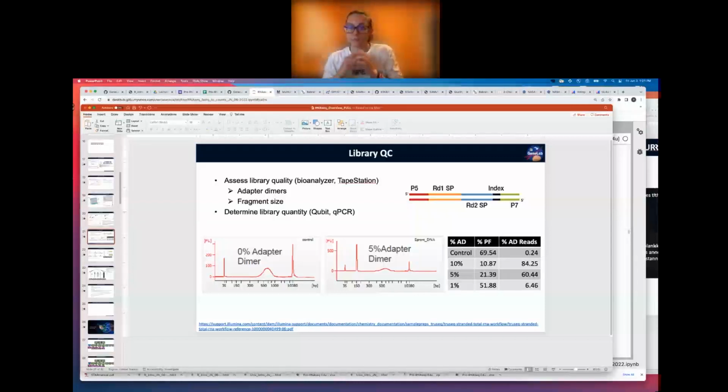So that way, we have the same samples running on each flow cell. If we have a bias in one lane, where maybe there's some damage to that lane of the flow cell or something, we don't get as much coverage there. We have all samples run on all the lanes of the flow cell, and so that same thing is going to be affected for all samples, to help account for that.